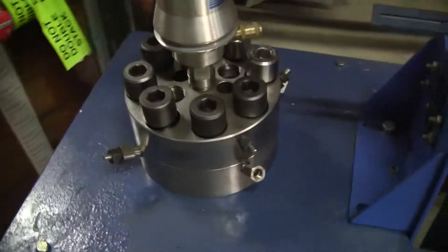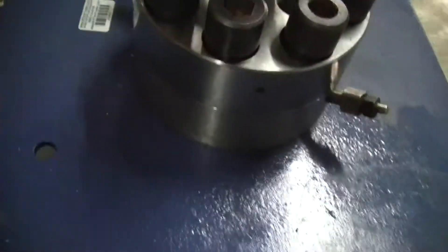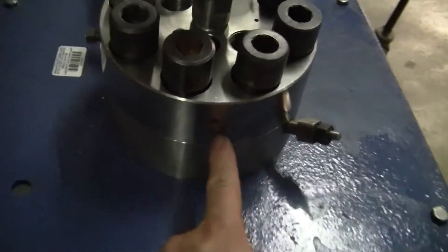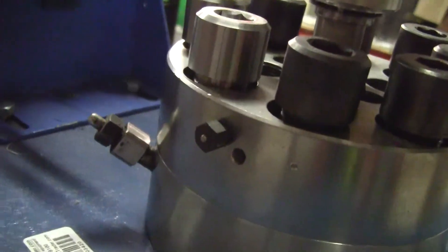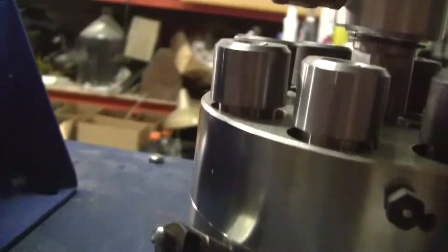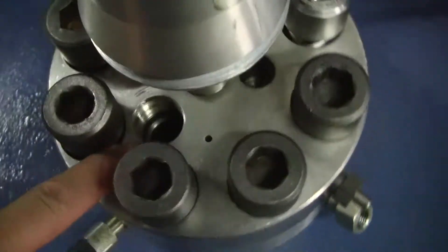Got some in and out ports. Another one on the side. Coming around, and then on this side. To note on the top, let's take a look at the top ports. These are the half inch ports on the top.